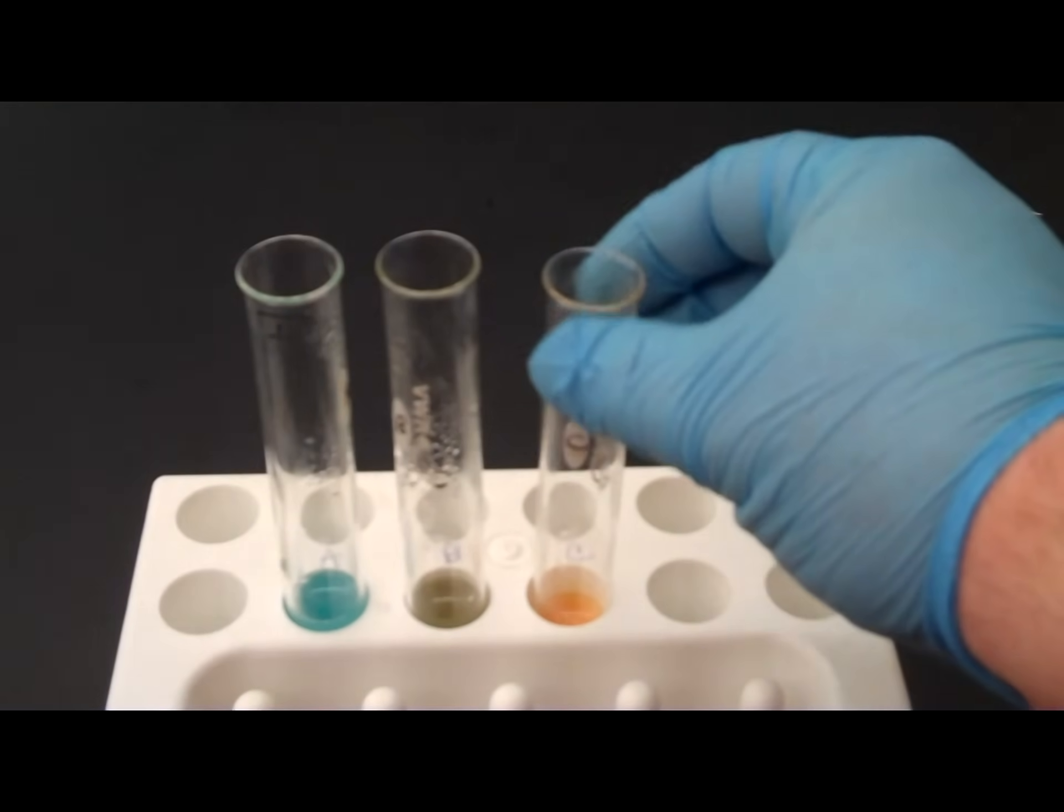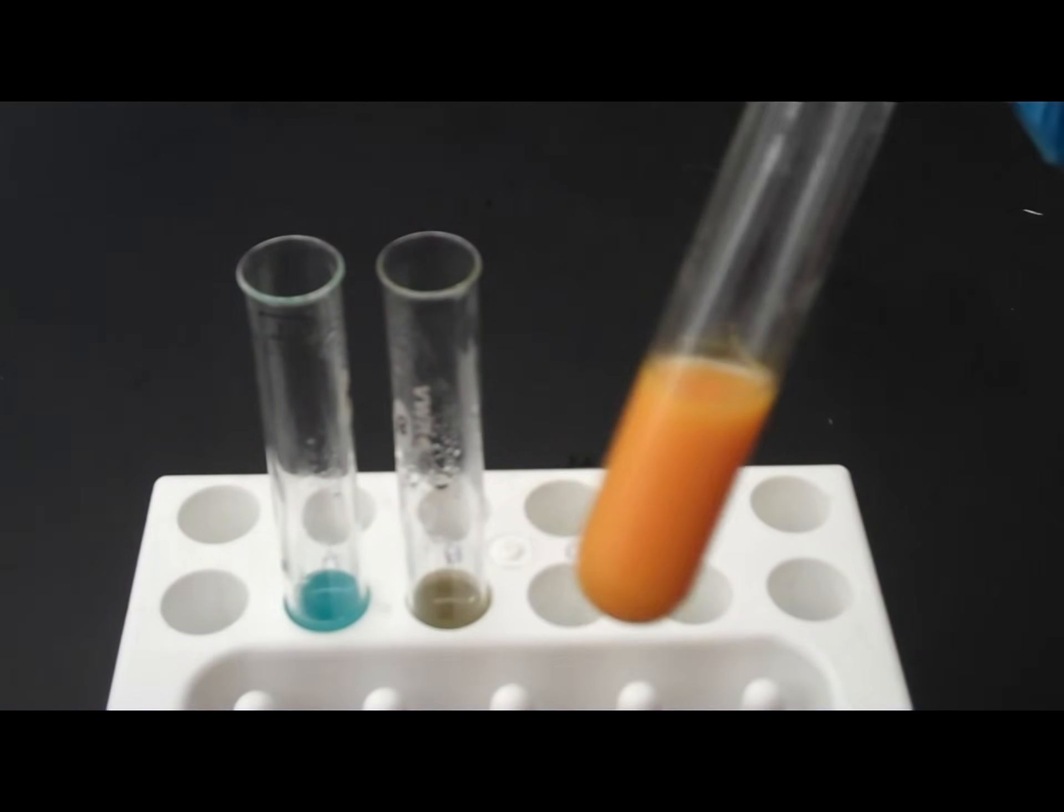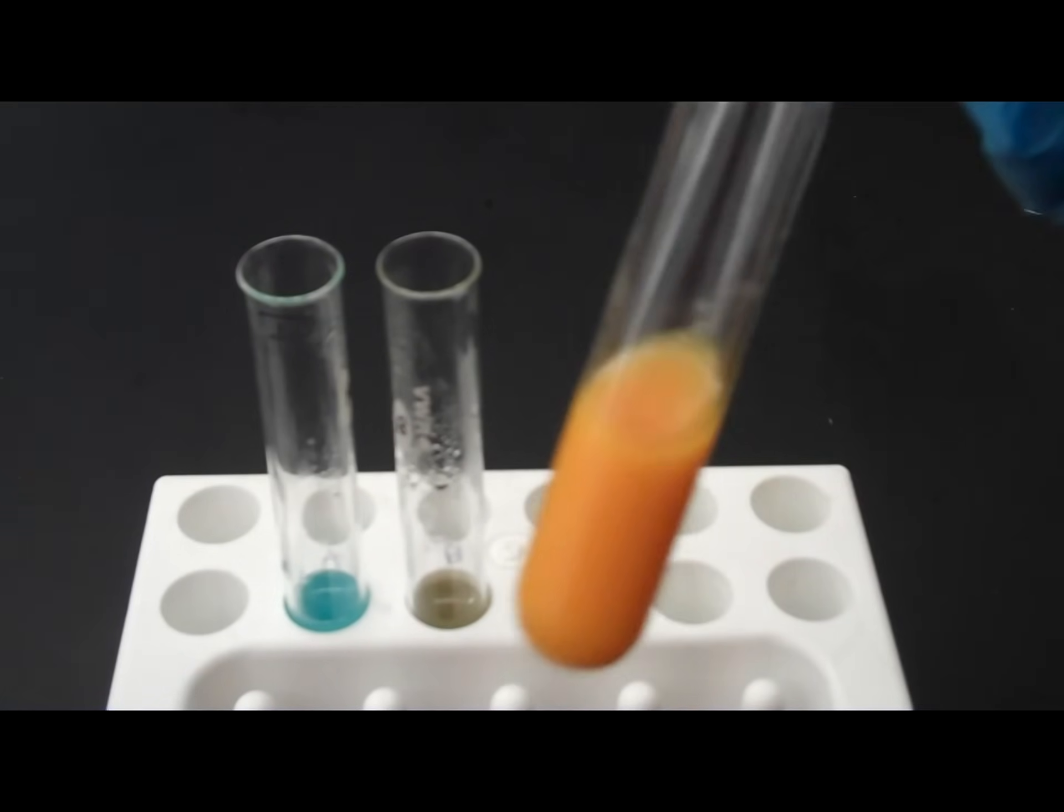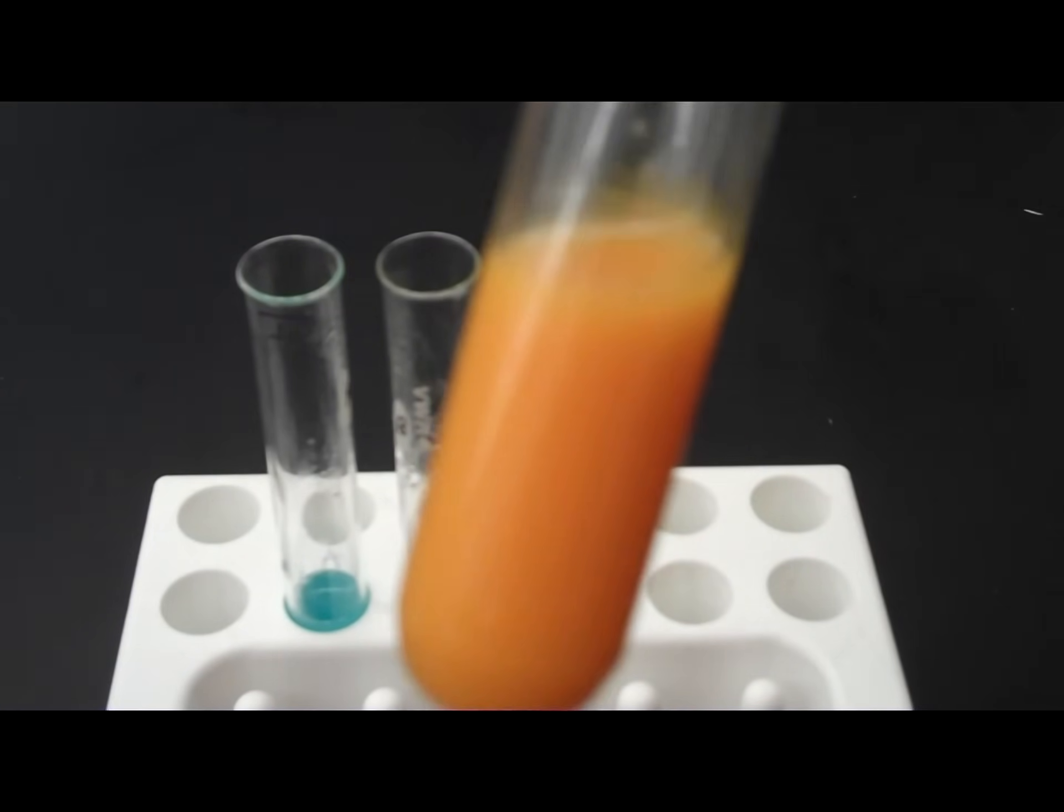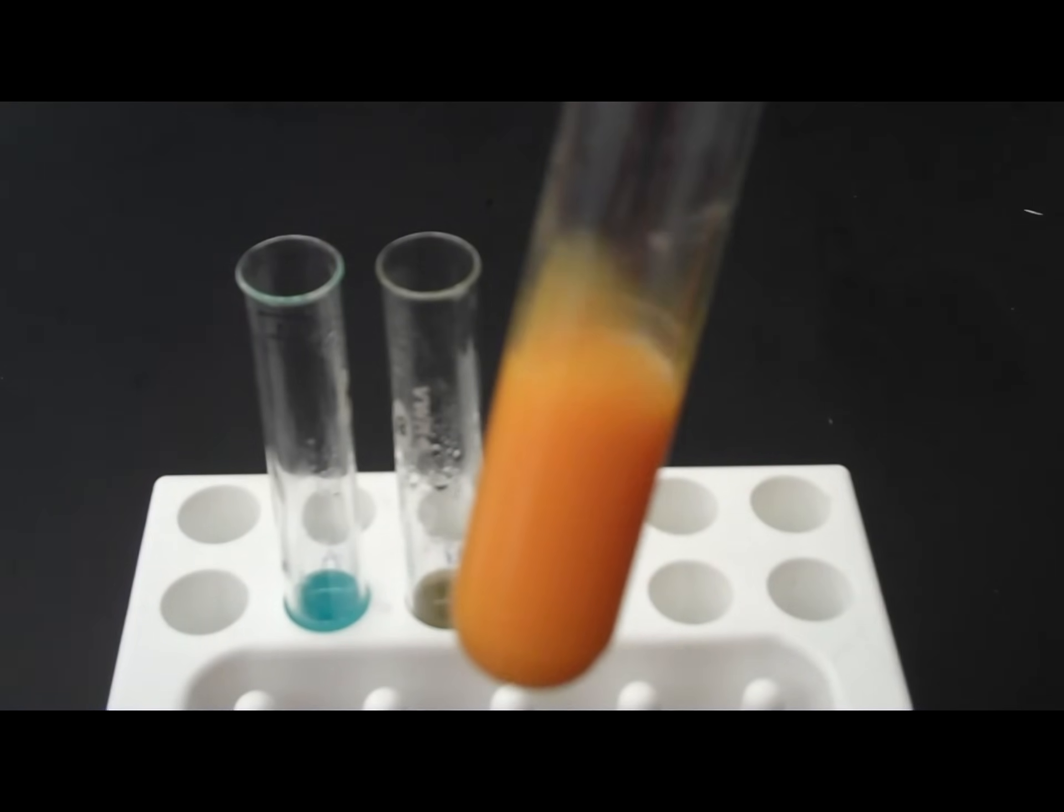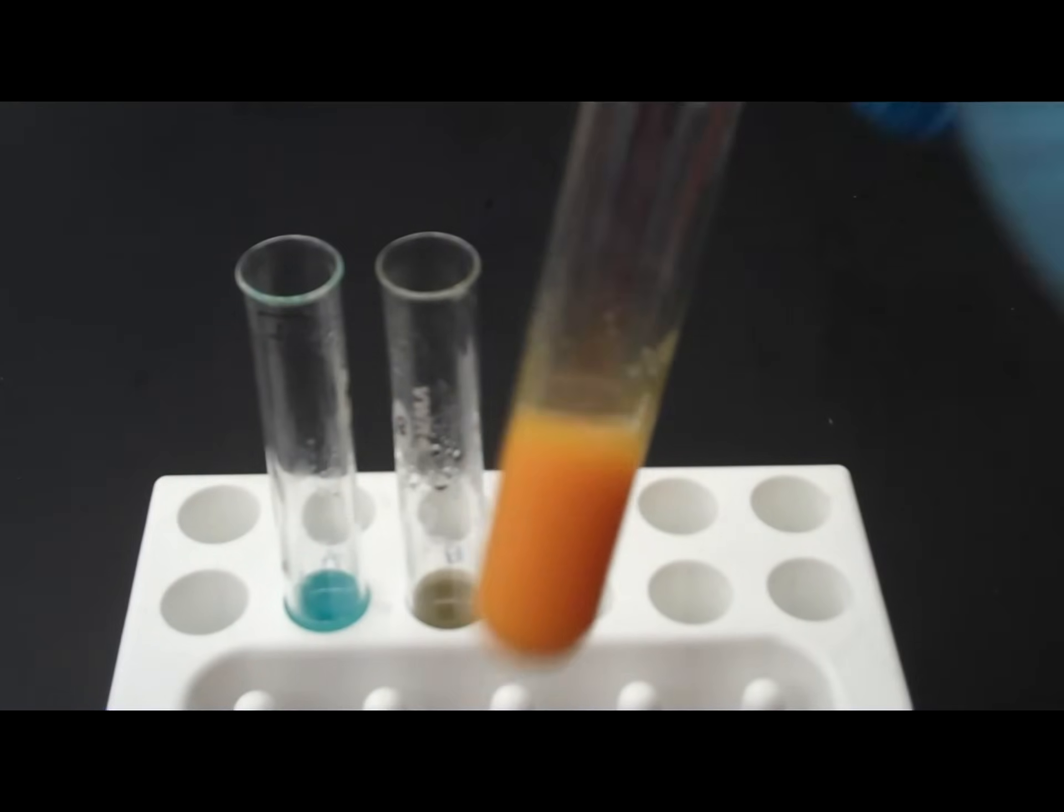Alright, so let's look at our results. This is our control group. Remember, we didn't do anything to this other than add a little bit of distilled water. So, this would be a positive test for simple sugars. Notice that the amylase has turned the starch into simple sugars. Therefore, we got an orange color.